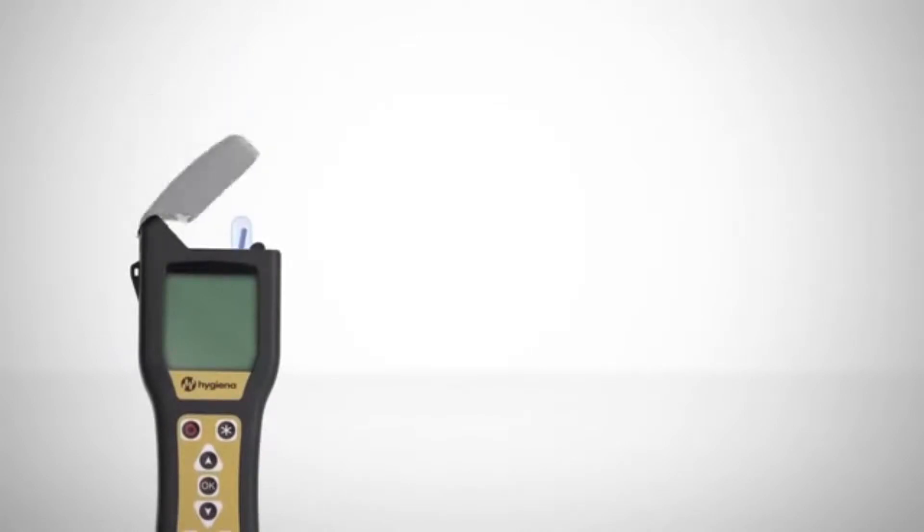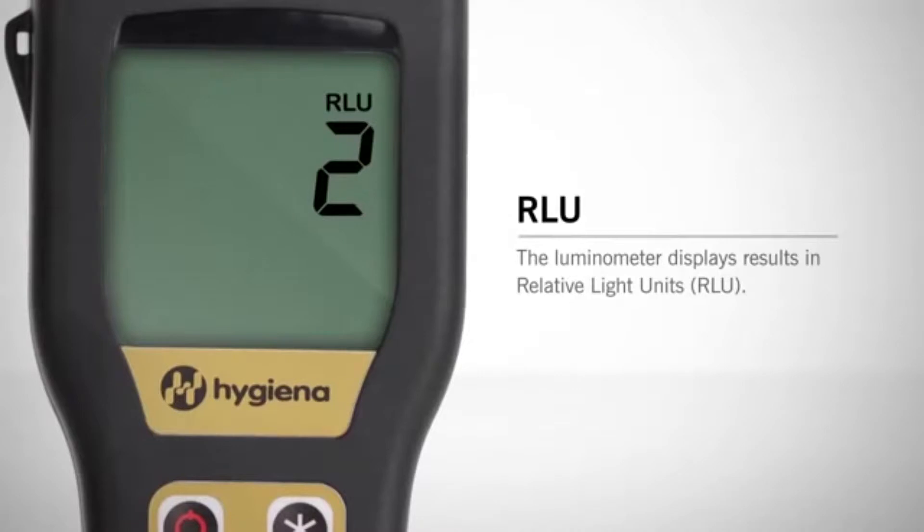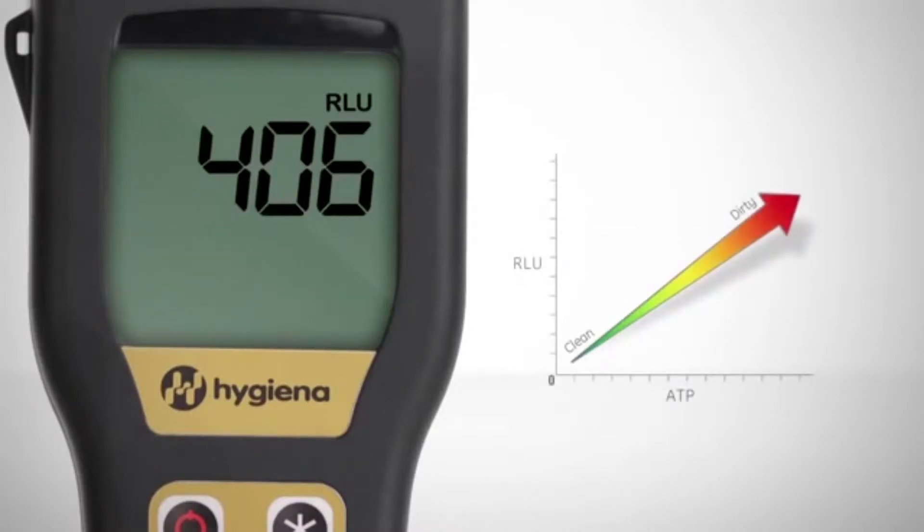Test results are delivered in 15 seconds and are expressed in relative light units, or RLUs. An RLU result is directly proportional to the amount of ATP collected from the sample. So the greater the amount of ATP, the greater the RLU number, and the dirtier the surface.